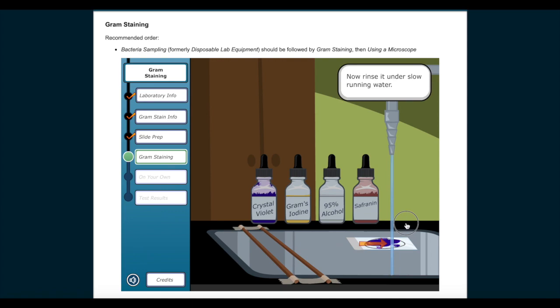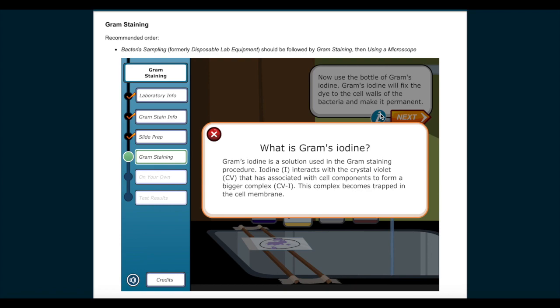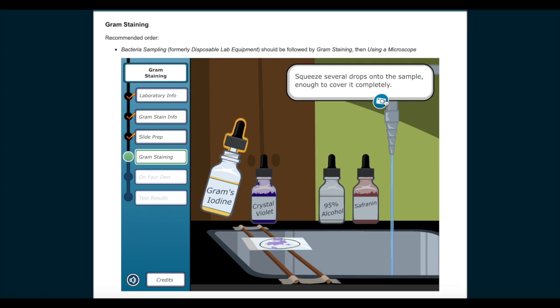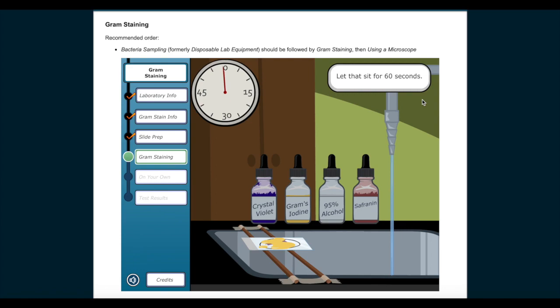Now use the bottle of Grams iodine. Grams iodine will fix the dye to the cell walls of the bacteria and make it permanent. What is Grams iodine? Grams iodine is a solution used in the Gram staining procedure. Iodine interacts with the crystal violet that has associated with cell components to form a bigger complex. This complex becomes trapped in the cell membrane. Squeeze several drops onto the sample, enough to cover it completely. Let that sit for 60 seconds. Now rinse it under slow running water.